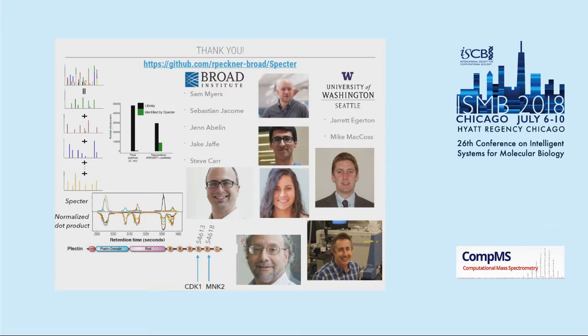Very convincing in terms of the identification you're getting. I'm just wondering if you also looked at the accuracy of quantification by using the whole spectrum rather than just single transitions or multiple transitions. We have assessed that. I don't have an example on hand, but again, in the context of that LFQbench data set, there were 2 spectral libraries that came with the paper, one of just pre-selected assays of about 6 fragment ions per precursor versus the whole shebang.